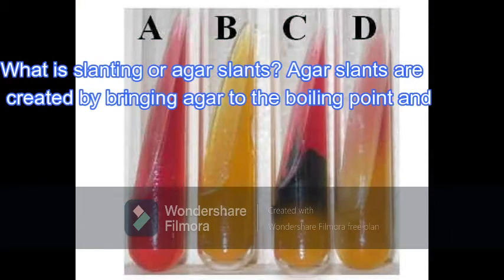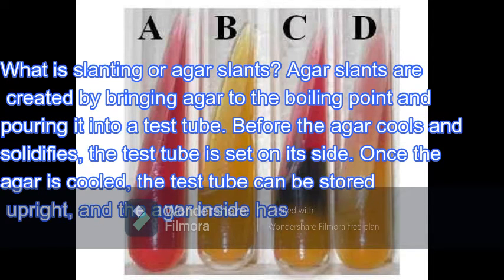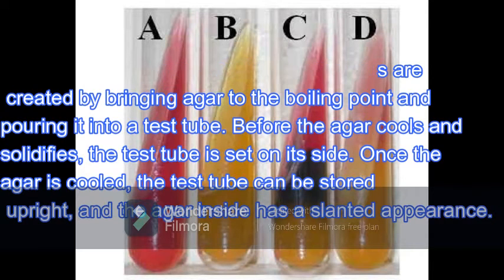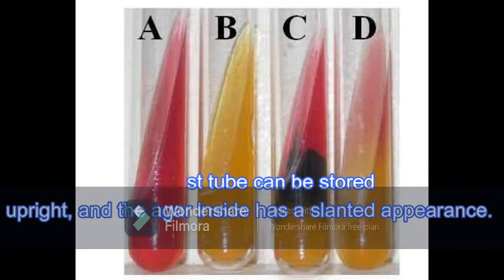What is slanting, or agar slants? Agar slants are created by bringing agar to the boiling point and pouring it into a test tube. Before the agar cools and solidifies, the test tube is set on its side. And once the agar is cooled, the test tube can be stored upright and the agar inside has a slanted appearance.